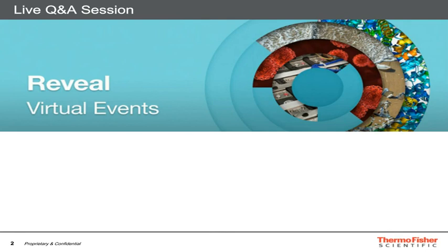Right. Thank you, Min. The next question is about Raman. So since Raman is the photon in, photon out technique, what is the maximum sampling depth?